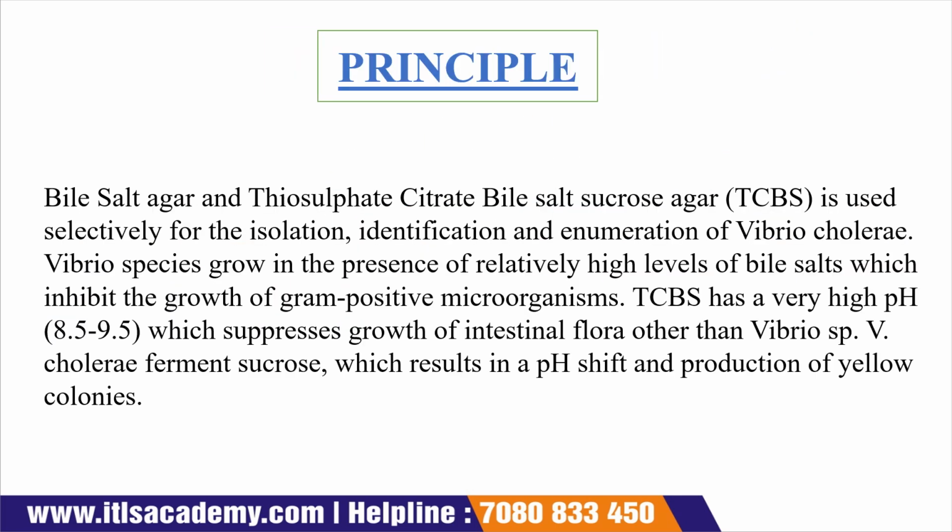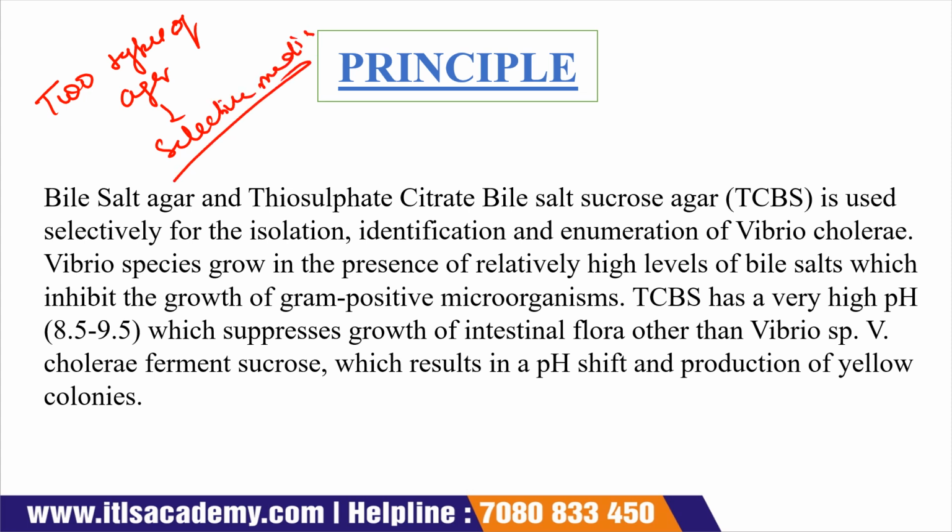Now, the next is the principle of this experiment. Here we are going to use two types of agar. They are selective media, which means that they only grow Vibrio cholerae.